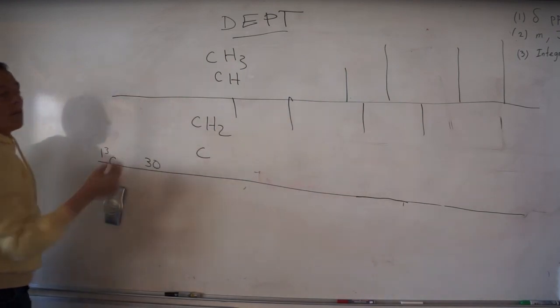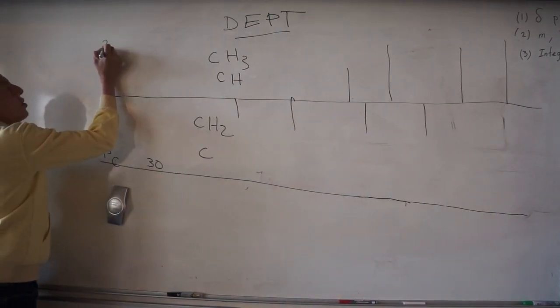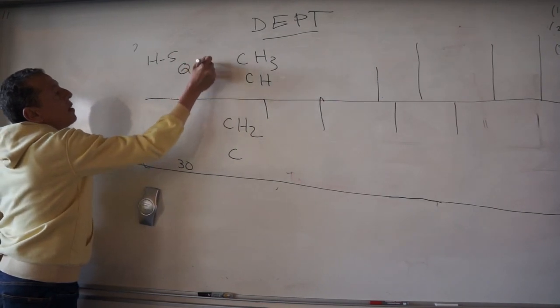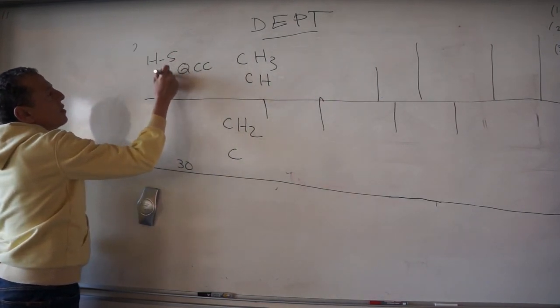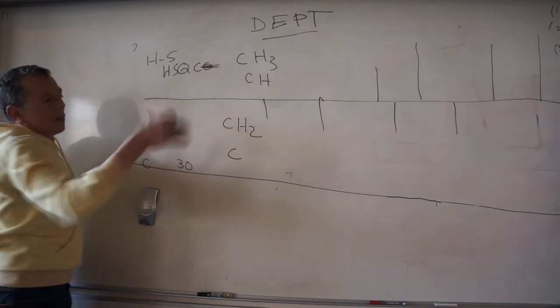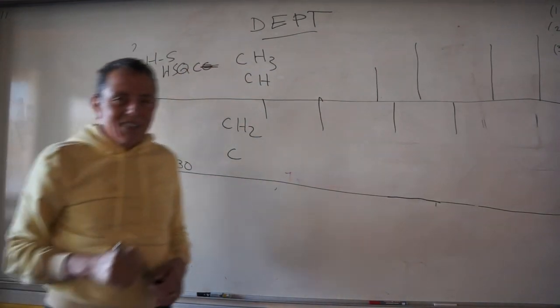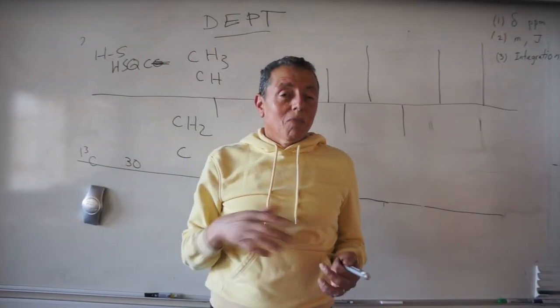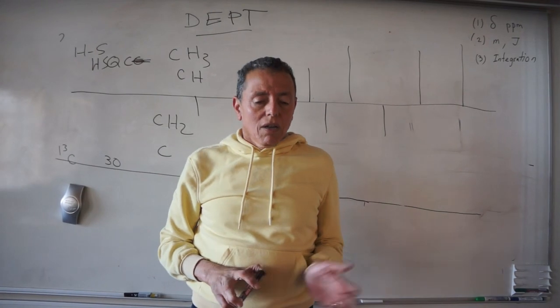Of course, when we come to two-dimensional NMR, you will interpret HSQC and DEPT. This will help us more in structure elucidation, and I'm going to discuss it with you in the next lecture about two-dimensional NMR.